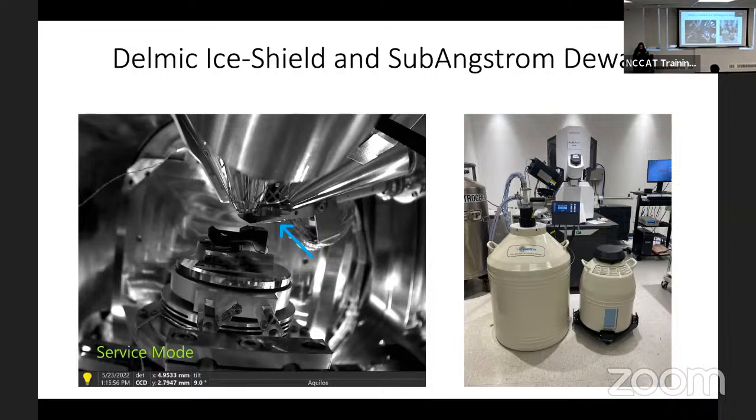So it's cooled, it goes in at, there's a file that you could tell it what currents to go in at. So I have it go in all the time, from 10 picoamps, which is the lowest current we currently use, and until the highest. If you have the Thermo Fisher version that just comes with the scope, that's very arbitrary, I think it starts going in at like 3 nanoamps or 7 nanoamps or 5 nanoamps, one of those. So it doesn't go in any earlier than that.